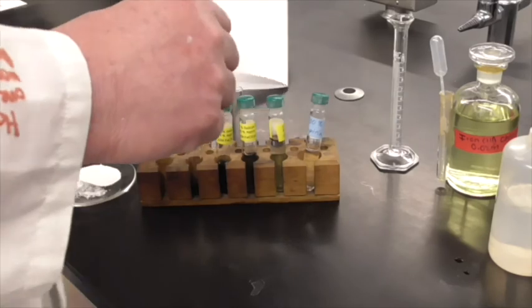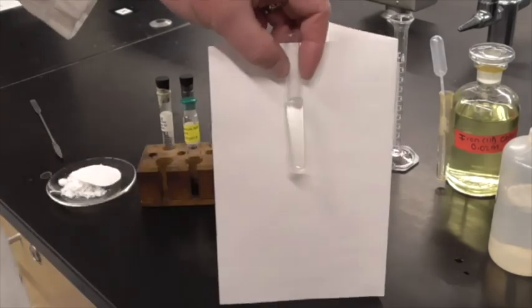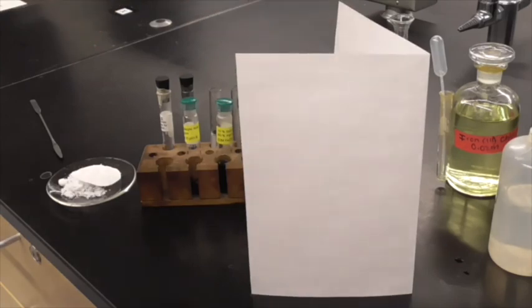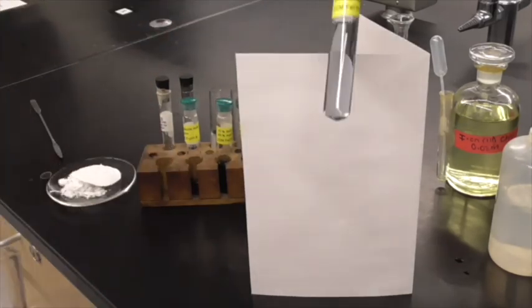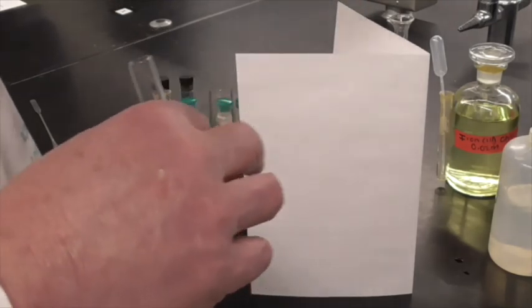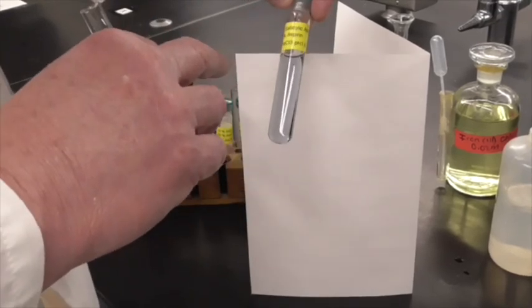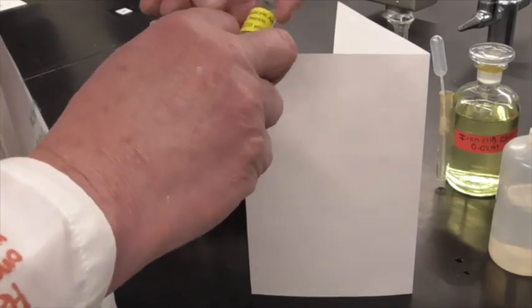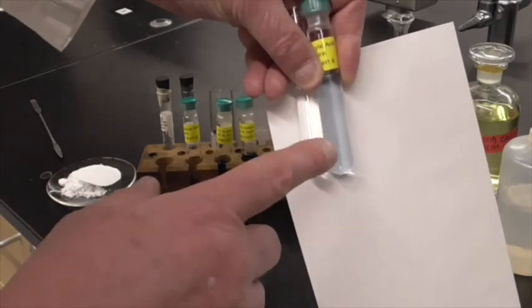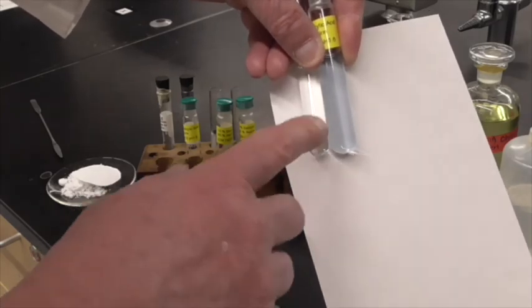Okay, so I've got a white sheet here so we can compare. So this is our solution. See, it's pretty clear. I don't see a whole lot of color in that at all. If we compare it to this solution that's got 97.5% aspirin and 2.5% salicylic acid, so somebody ran a reaction and most of the material converted over to aspirin, but there was still a little bit of salicylic acid left in there. You can see if we compare the two, the one with the salicylic acid in it has quite a bit of violet color to it, and ours just does not.